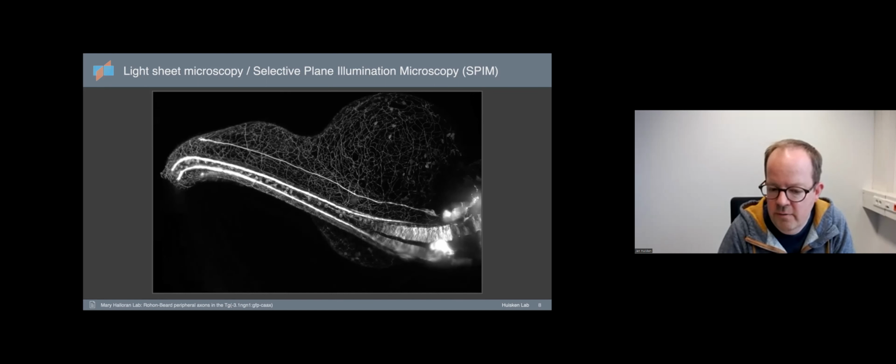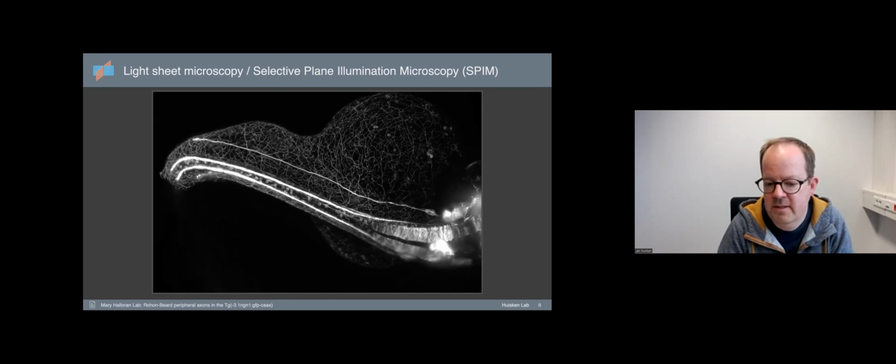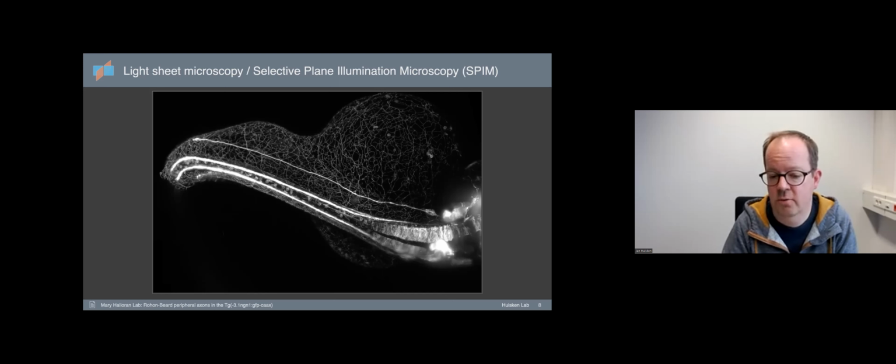And so in order for this experiment to be successful, into creating an environment for this fish to grow happily inside the microscope, and then so that it doesn't move during the acquisition and it still has enough space to actually grow and develop. And so that's always a tricky trade-off to be made.